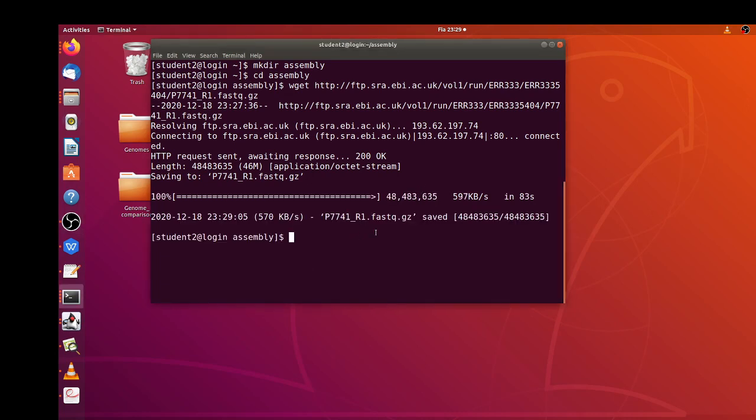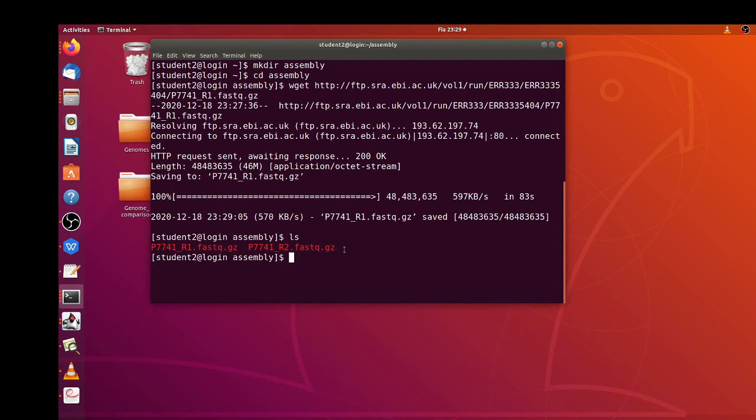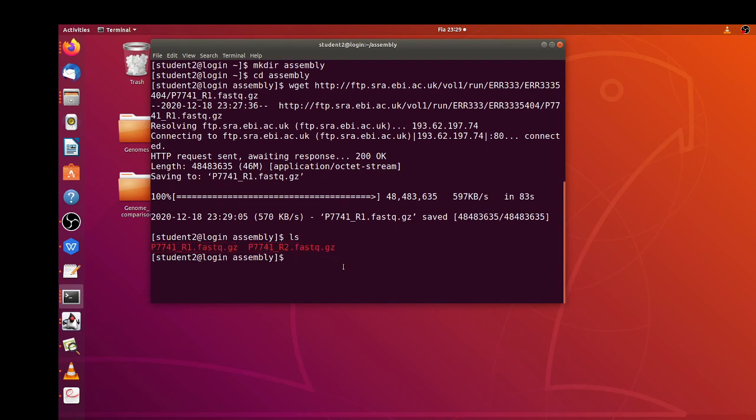Okay, so now that I have the datasets downloaded we can proceed. First let's confirm with the ls command. Yes, so now we have the two datasets there. Now let me load my SPAdes software.